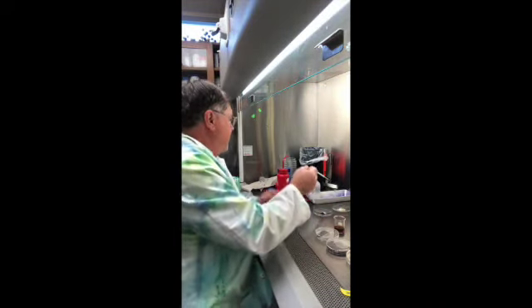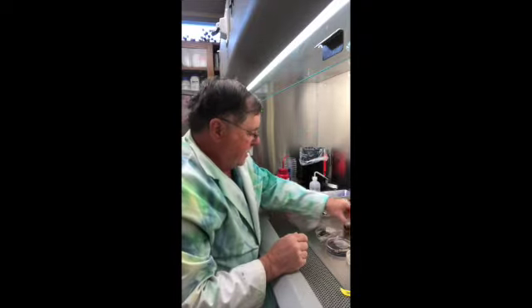Okay, and then we need to let it sit for a little bit, and then we'll come back and look at it.